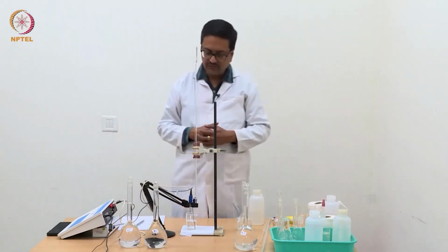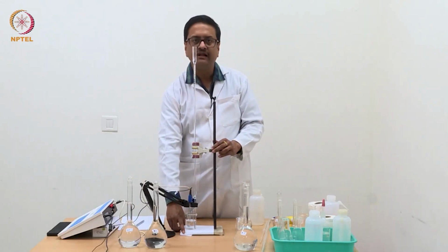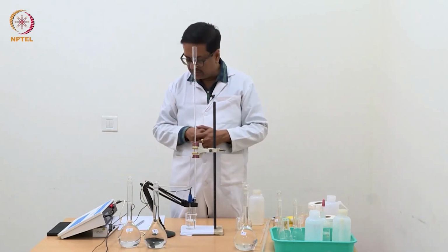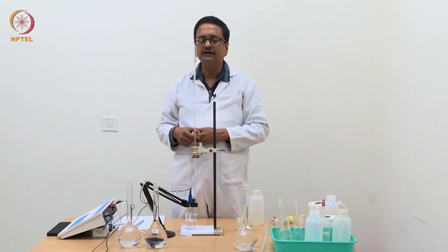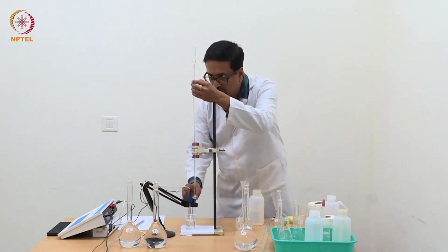So like that, we keep on adding small amounts of NaOH solution from the burette and keep writing down the readings till we see a drastic change happening in pH. So now I will go a little fast.